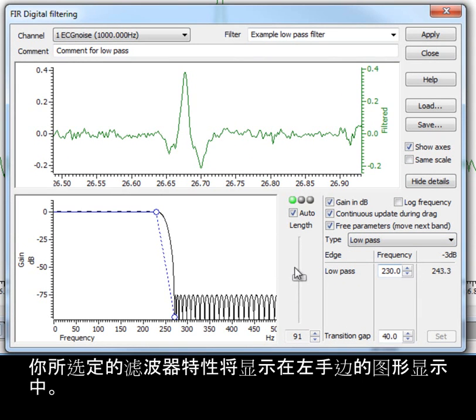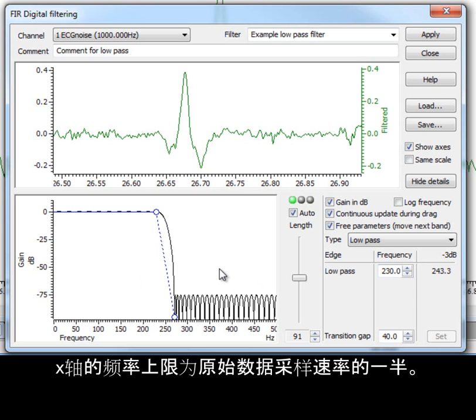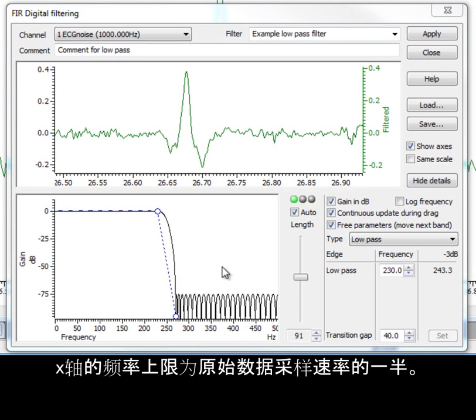The characteristics of your chosen filter are shown in the graphical display on the left-hand side. This shows the frequency range up to half the sample rate of the raw data on the x-axis.